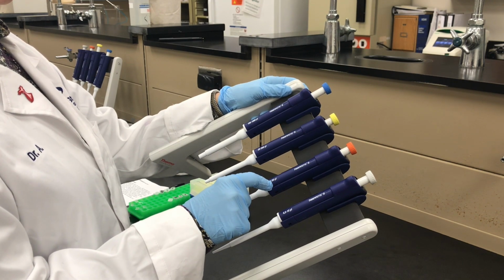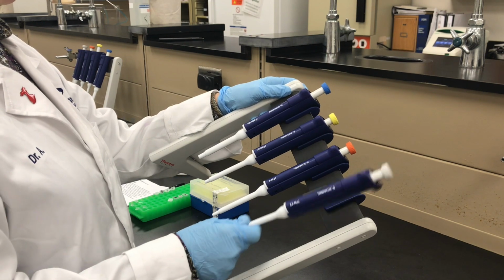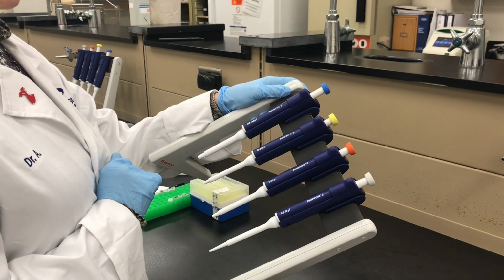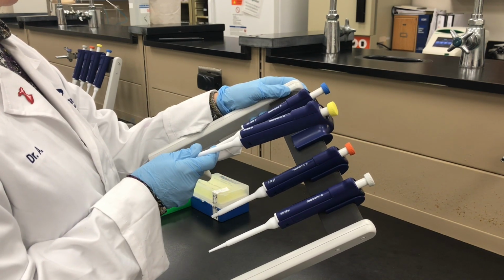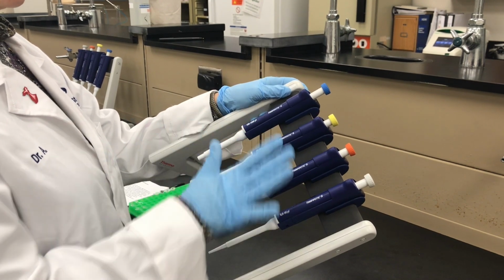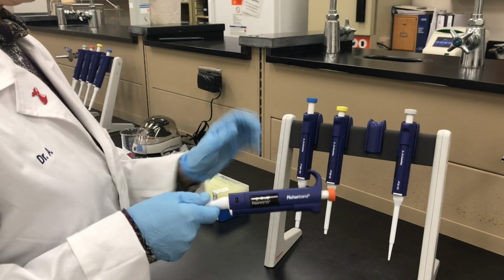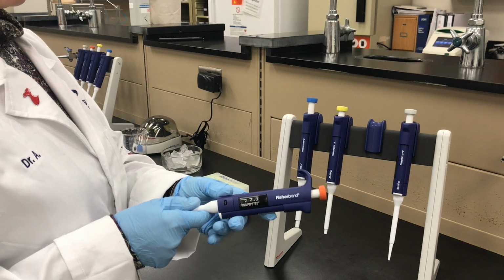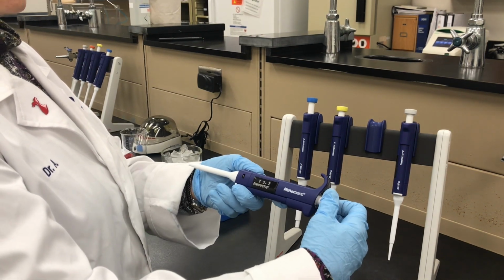You could do 6, 7, 8, 9, 10 on here, but don't do the orange top if you can do the gray top. For today's lab, we're just going to be using the gray and the orange, okay? If you were here practicing with them, you'd also be using the 20 to 200, but we're not. So that's a set of them. The range is here. Now, turn it to the side, the number, the exact microliters. You turn the colored part at the top.